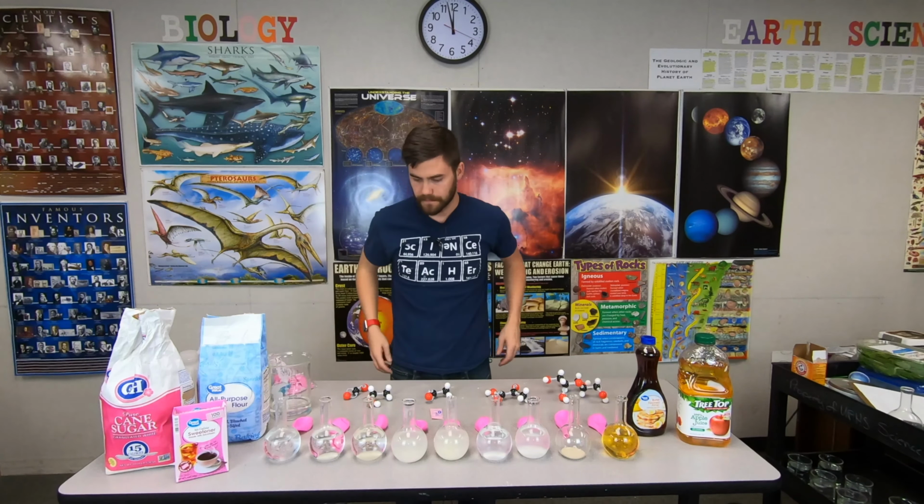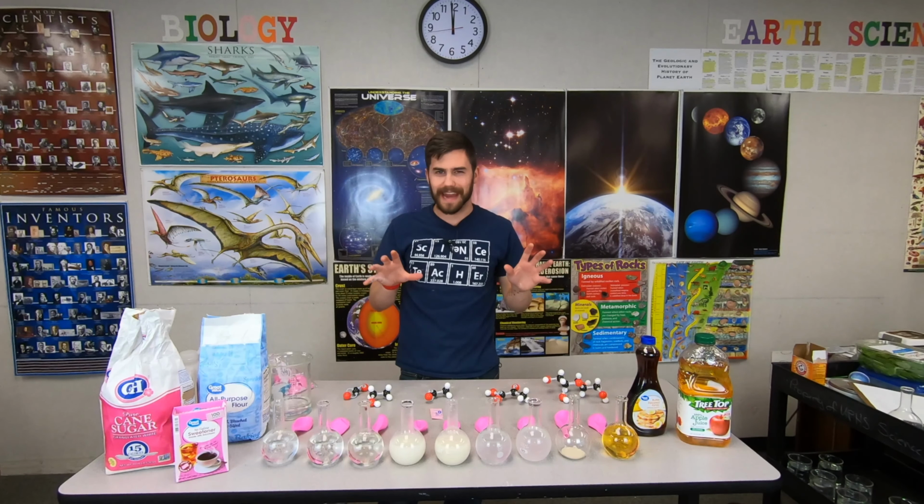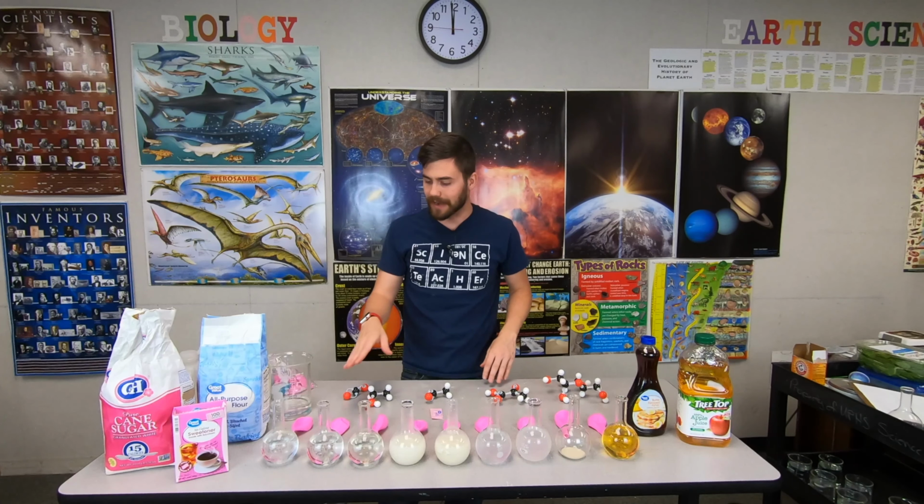So now I got to mix these up. I think that's about as good as I can get it. If I had more hands, this would be a little easier, a little bit more accurate.